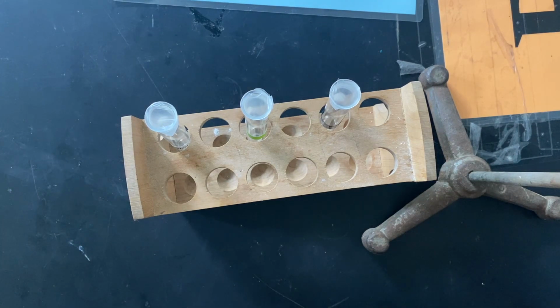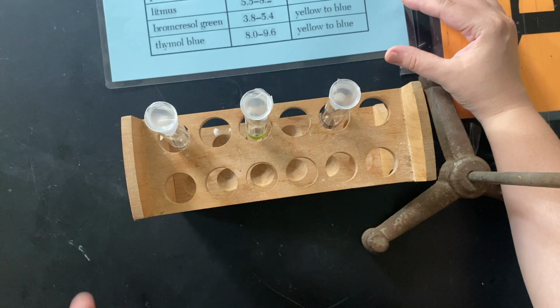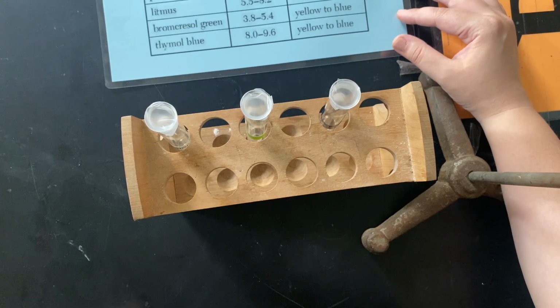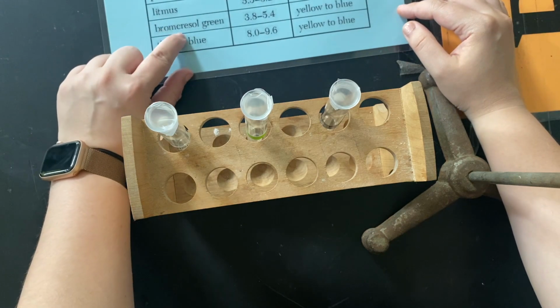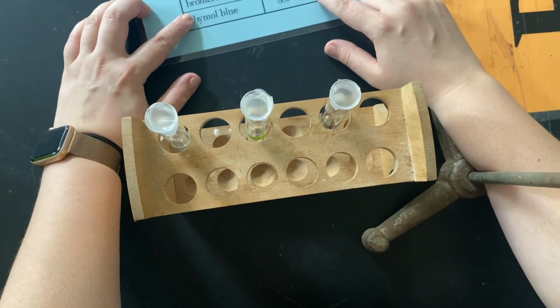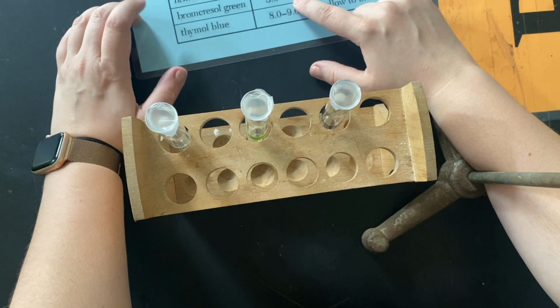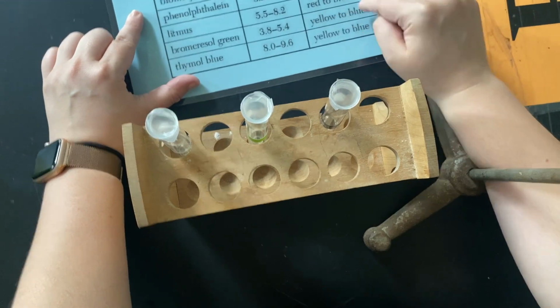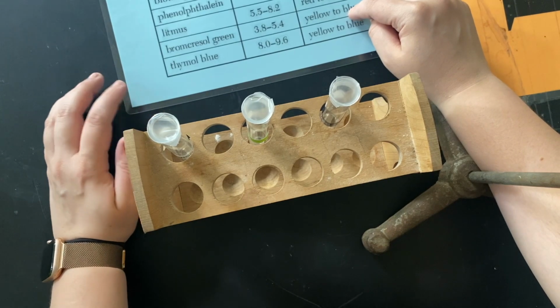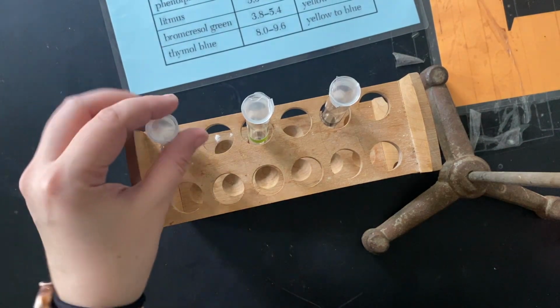Now the way in which you will do that, we tell you what the pH should be. So using that information, you should be able to use Table M to figure out what color the indicator should turn the potion. For example, Potion 1, the pH should be 7.2, and we're going to use bromocresol green to test that. If this was brewed correctly, 7.2 is going to be bigger than 5.4. If it's bigger than 5.4, it's going to be blue. If it's brewed correctly, it will be blue. If it's not, it will be the other color. Same thing with all the other ones. So let's test it out.